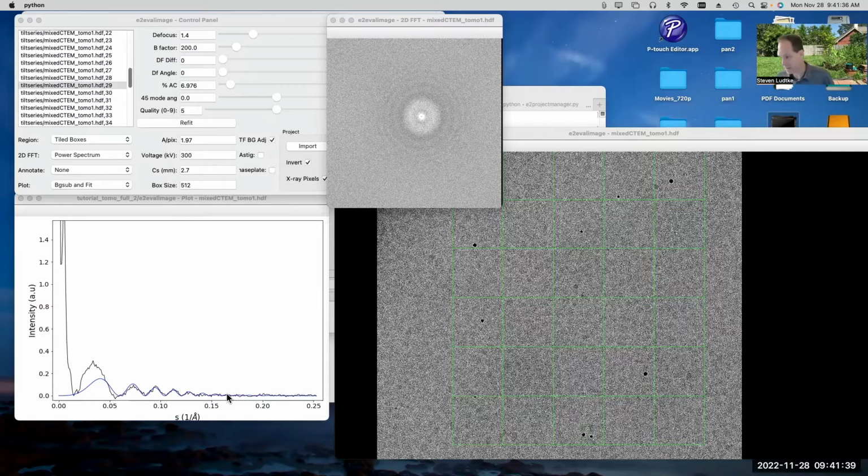Now, in the olden days, when you were doing tilt series, typically the contrast you'd get out was not nearly this good, and it would be really hard to see the power spectrum here on one individual tilt, because the total dose in a tilt was just a 20th of the total dose that was present in a typical micrograph. So you might often see just the first peak and the first zero, and you might not see too much beyond that, particularly at high tilt.